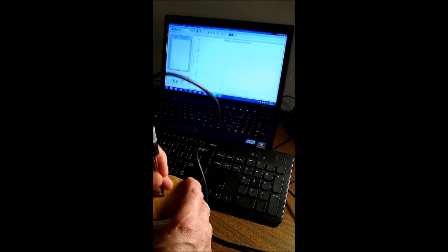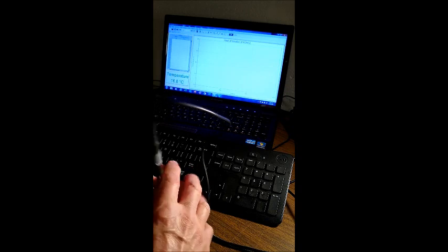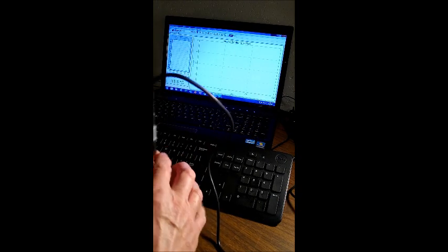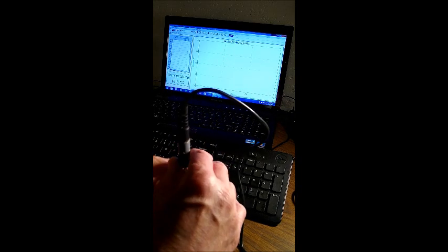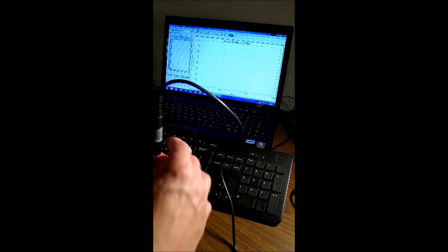Now I want you to watch the screen, and I'll zoom in. But here I have the temperature probe. Now normally in a lab we would put this on a ring stand. I'm just going to put it in a beaker so it doesn't tip over, and I'm going to swirl it when I add the salt. So for now I'm just going to hold it here, and I'm going to start the software. I've set it for about 10 minutes collection. The temperature as a function of time is going to come out here. It should appear as a green line.